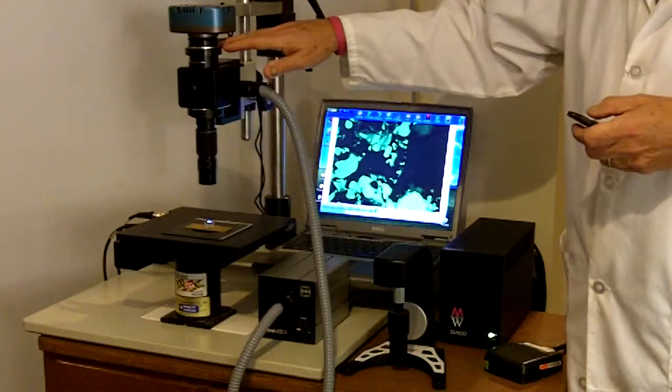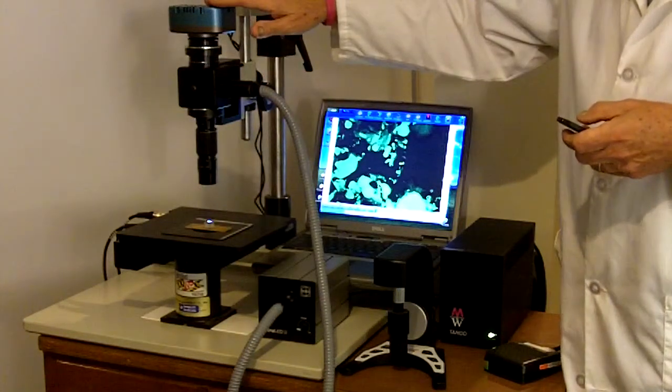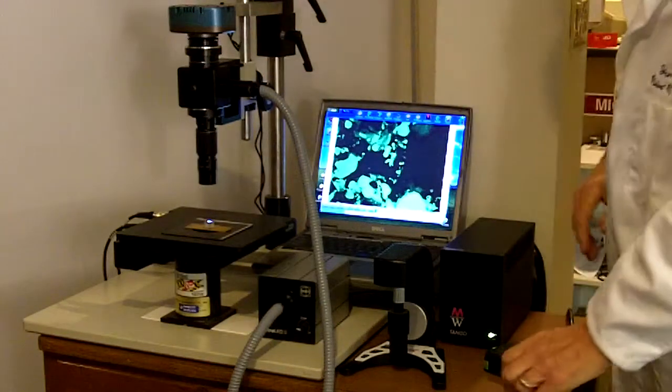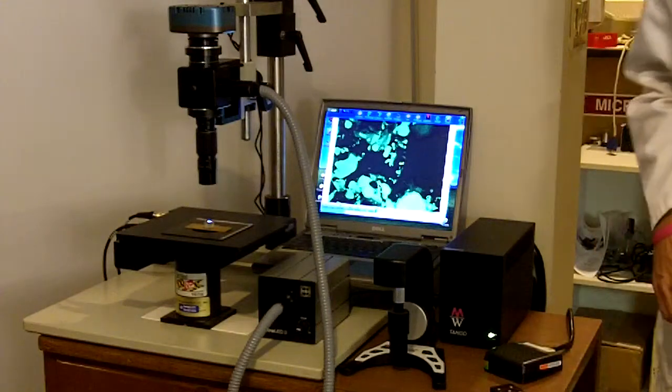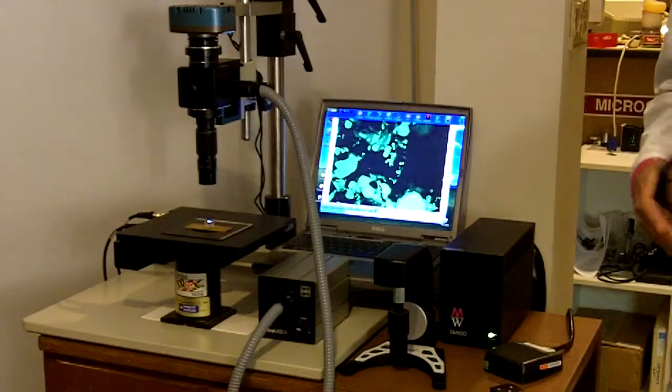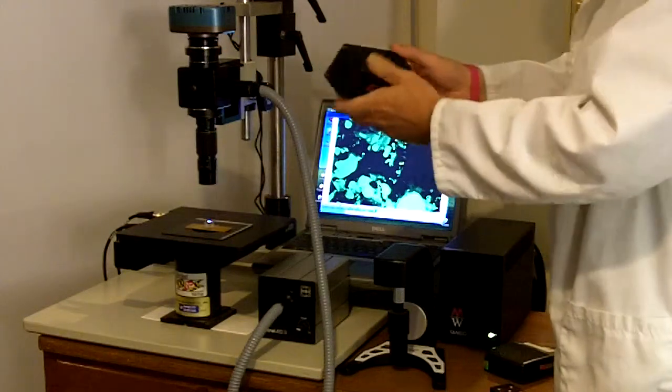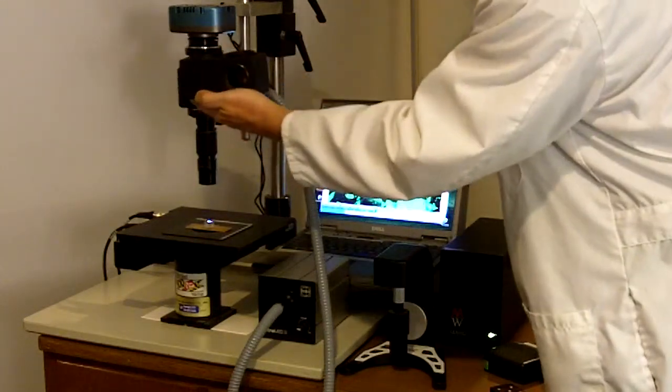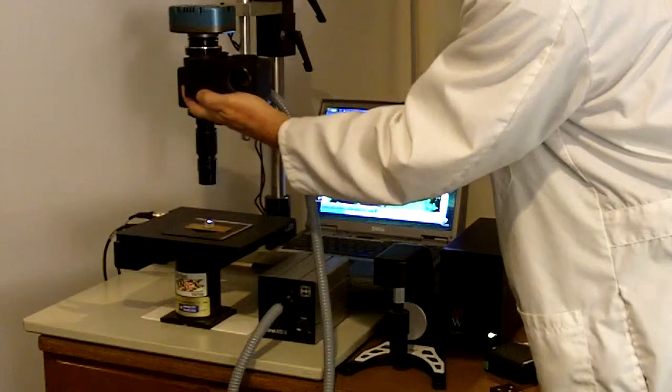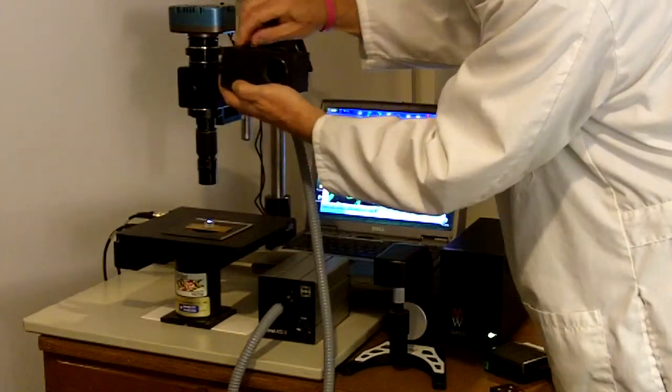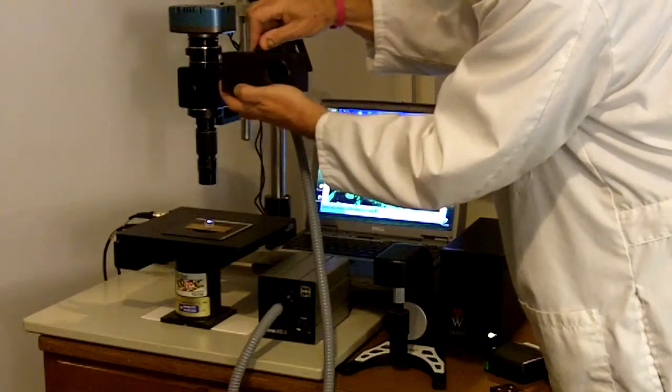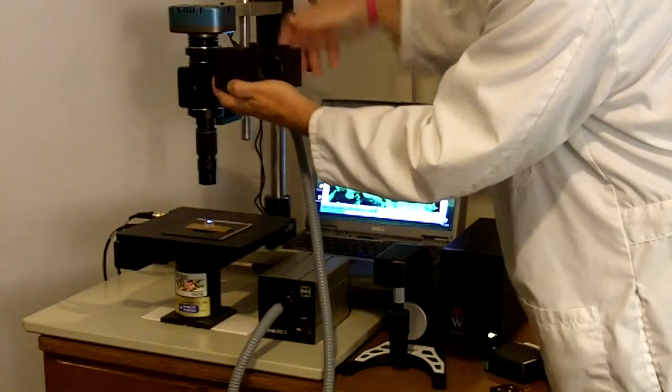In this case we've got a Peltier cooled digital C-mount camera, but on top of the C-mount module we can unscrew this and connect a dual port beam splitter. So this dual port beam splitter with a quick mirror release allows us to attach two cameras simultaneously.